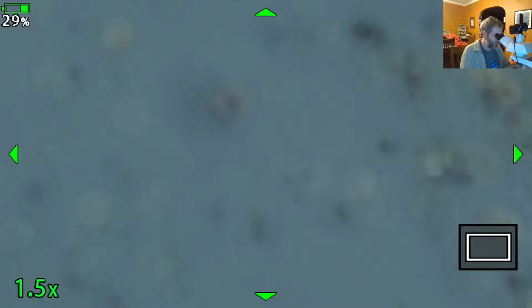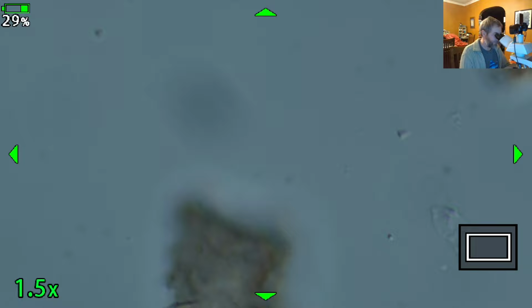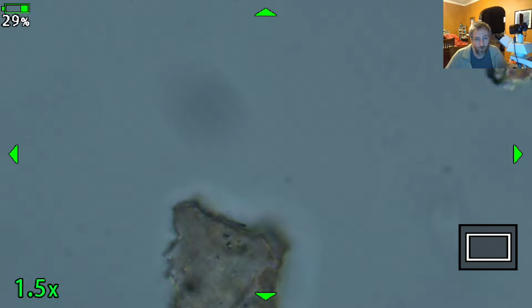And then of course it hooks up to my microscope, which I figured out how to do relatively recently. I think it does a great job of tracking what I'm looking at, and you get a nice high resolution image. I mentioned that it was a 20 megapixel camera, but it actually has a high res mode. If you swap it out, which I can do by clicking a button up on here, it'll actually take fixed 50 megapixel images of things that aren't moving. It does four sets of overlapping 20 megapixel images and turns them into one giant 50 megapixel image. And it also pumps out 4K video. So a pretty amazing camera.